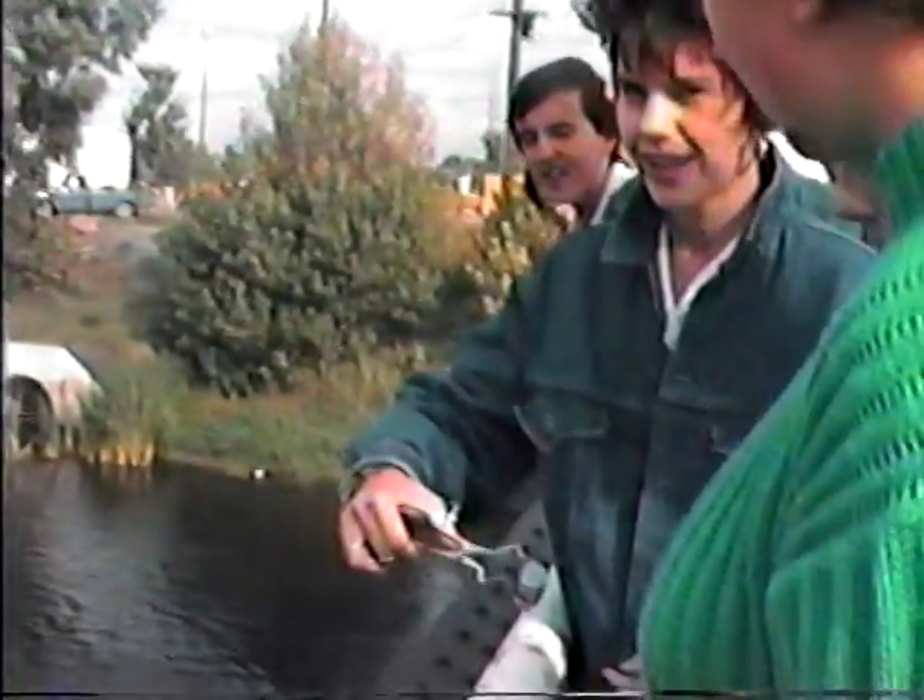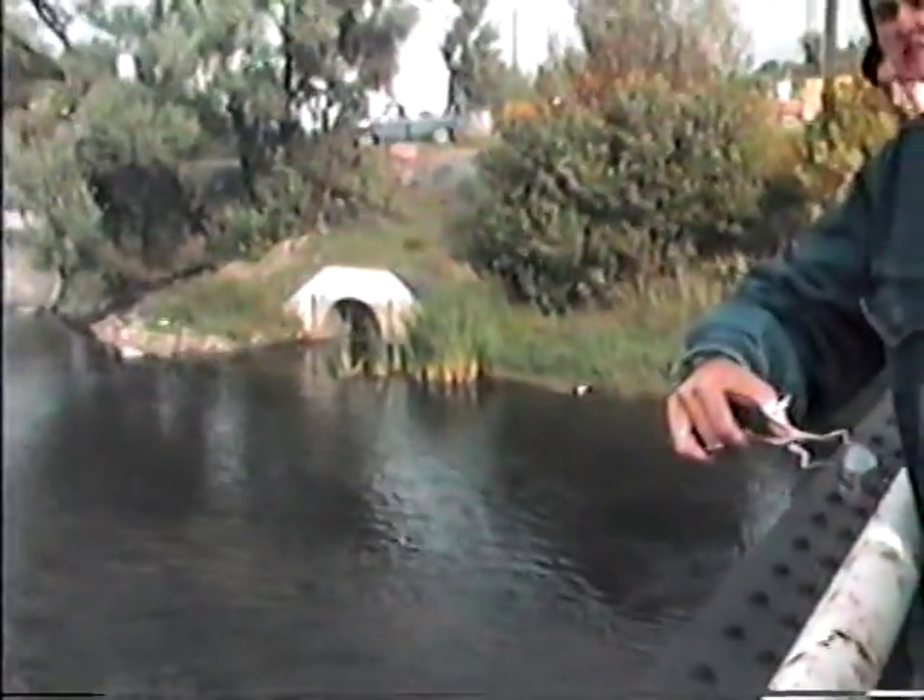Yeah, and Kathy, you don't toss it too far, but don't drop it straight down because I won't be able to see it. Are you ready? Okay, I'm ready. Just toss it lightly — toss it straight across. Yeah, just straight across.